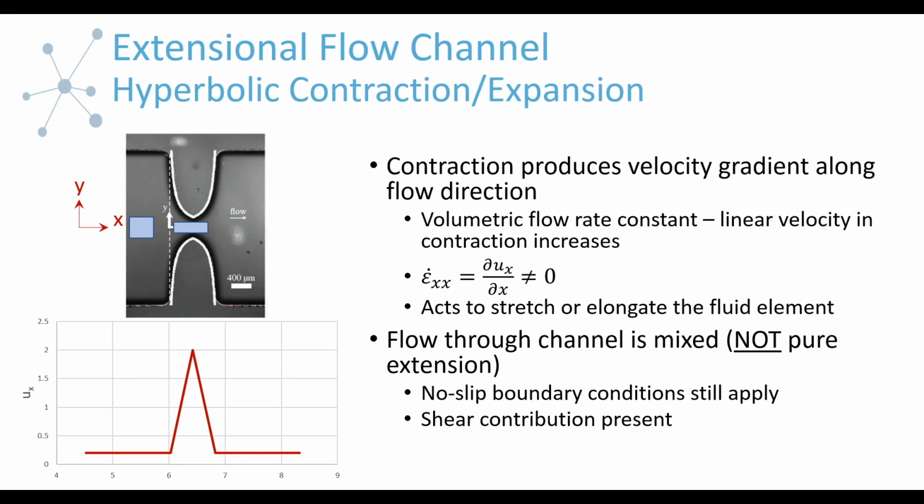So, looking at the data, and I can also send you, I'm not sure if you're the same person who also wanted the reference, but I can show you the data for where this starts and the way our pressure sensors are spaced. As I mentioned, there are some limitations on how they can be spaced, and so they're spaced a certain distance prior and after the channel.